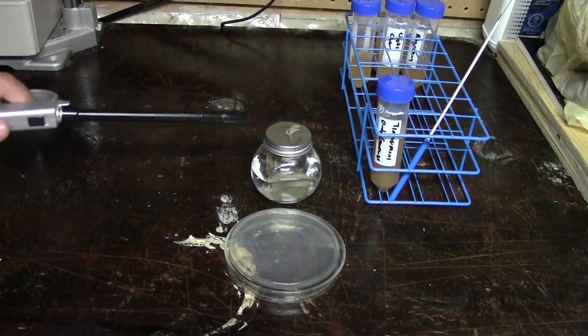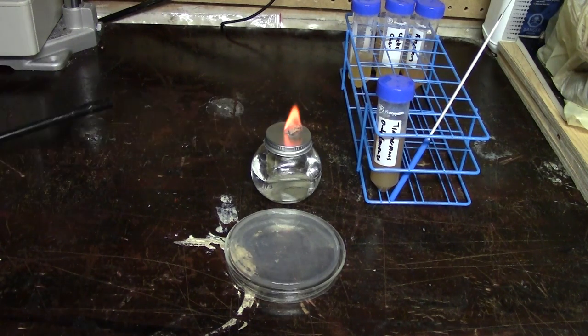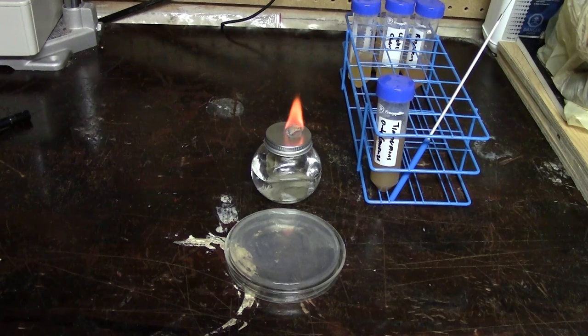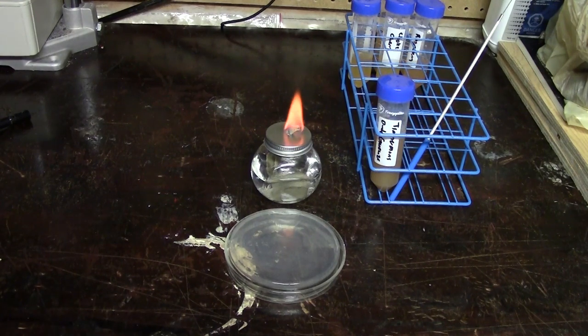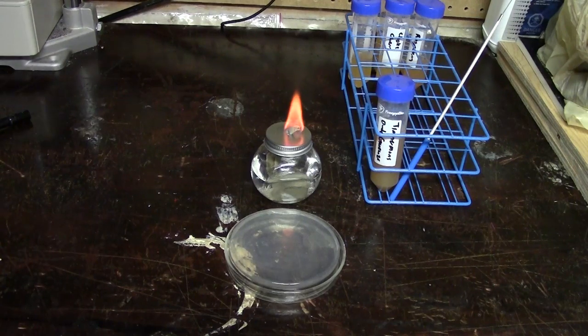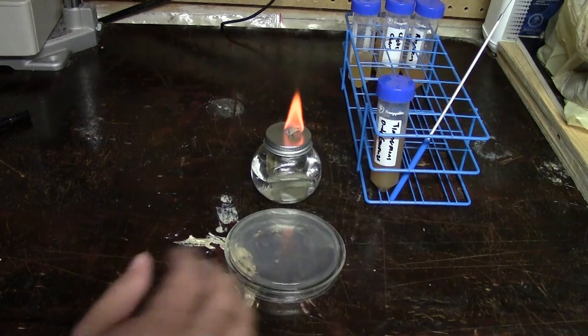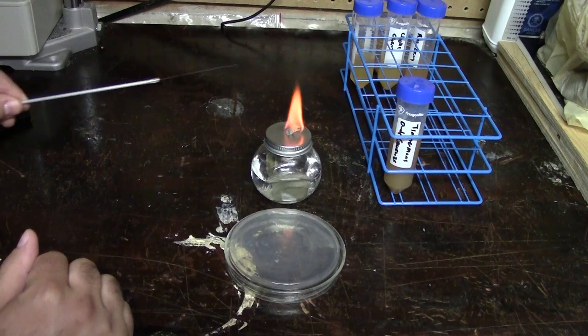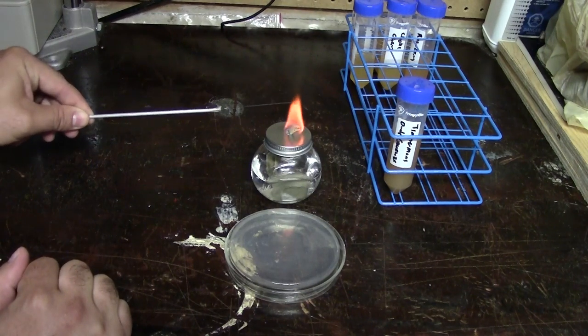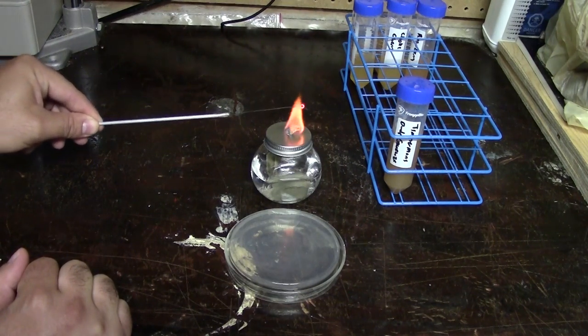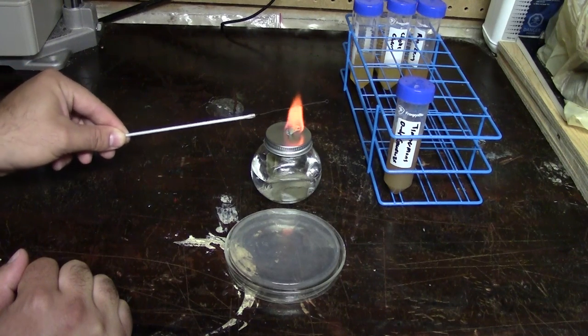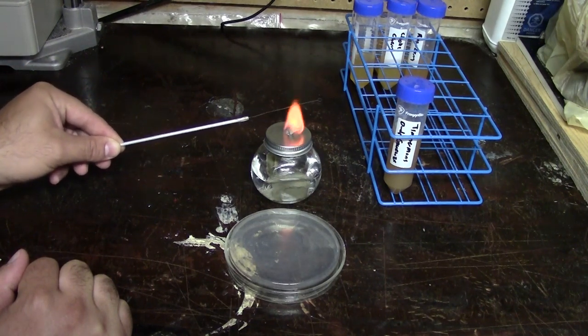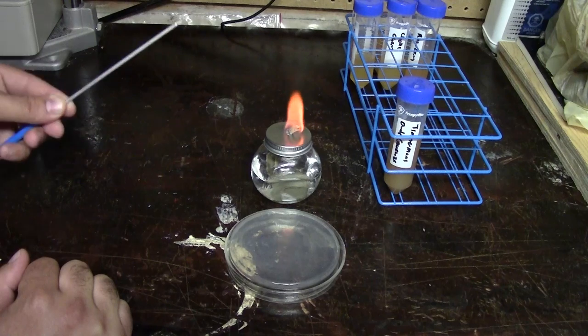So to start we want to of course light our alcohol lamp. This is going to create the area of sort of clean moving air that we can now work in, and of course also provides us with the ability to sanitize and sterilize our tools. So the next thing we need is to sanitize or sterilize our loop and you do that simply by heating it in the flame. As you can see it gets red hot. No organism on earth can survive that. So we now know that this is completely sterile.